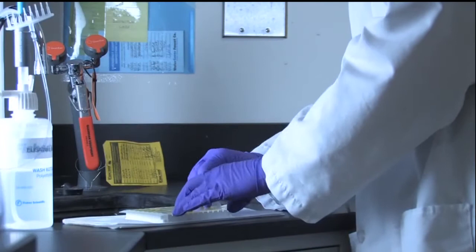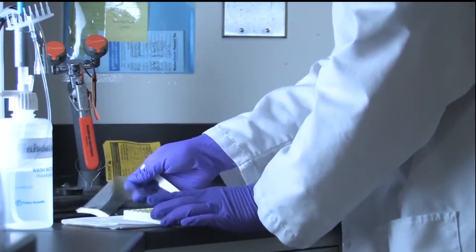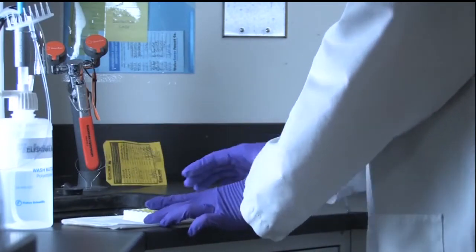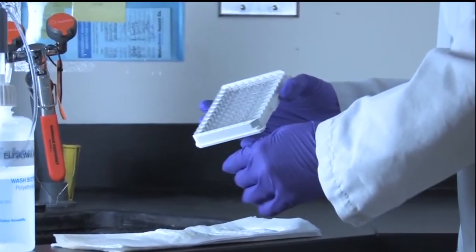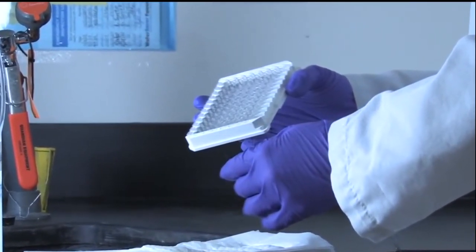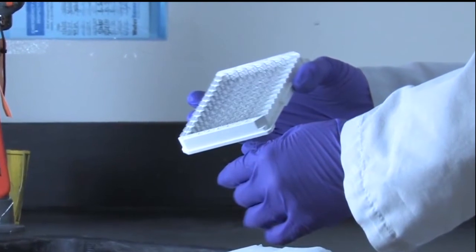If necessary, remove the plate sealer or covering that was used in the previous step of the assay. Squeeze the center tabs of the plate frame to ensure strips will not fall out of the frame during discard and drying.